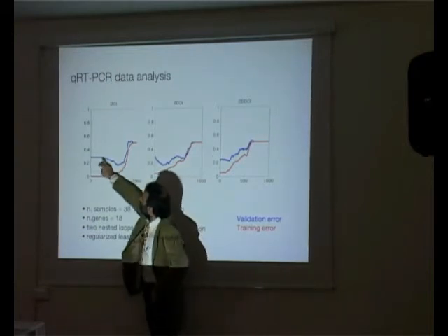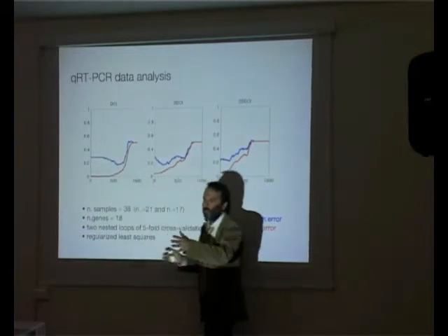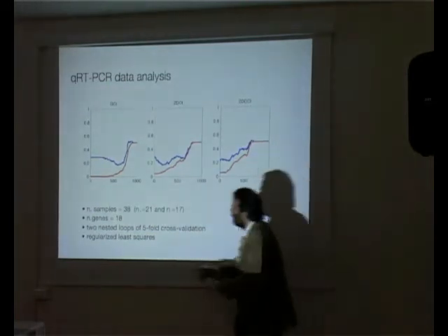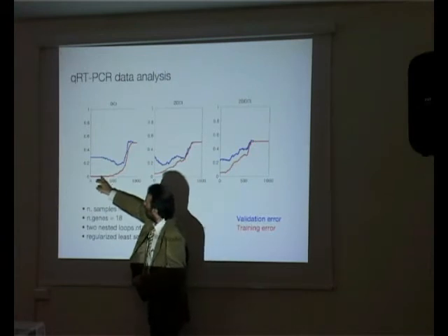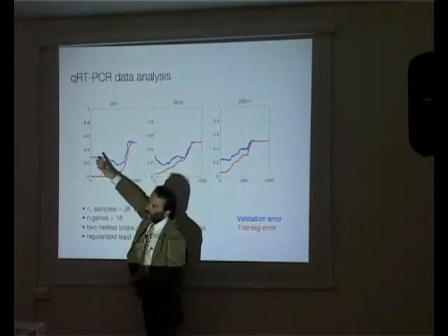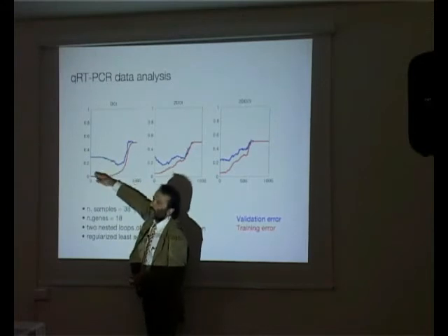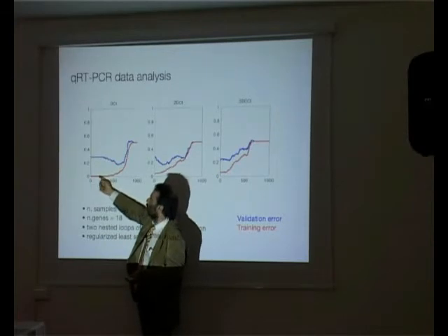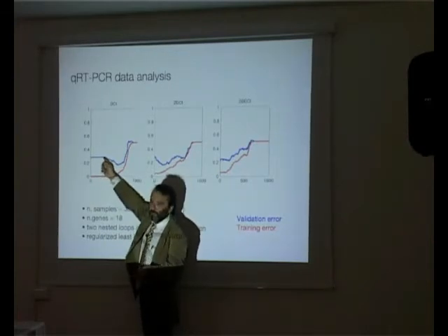And now this is the prediction curve. So what we do, we keep some data on the side. And we check, well, for this value of the parameters, what is our prediction ability? And when you see this gap, you know that you are overfitting. So you're in love with your data, so to speak, right? Or it's too easy to predict when you know the truth, right? And it's not that easy in real life.